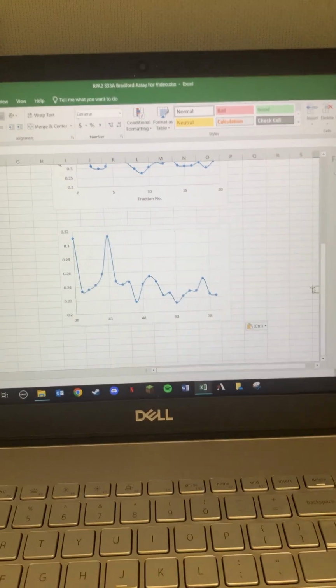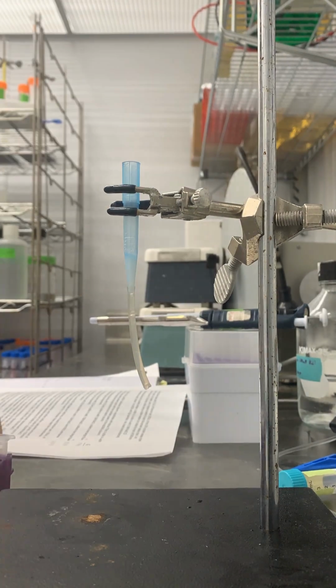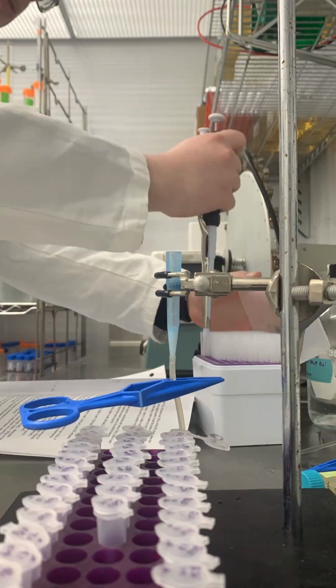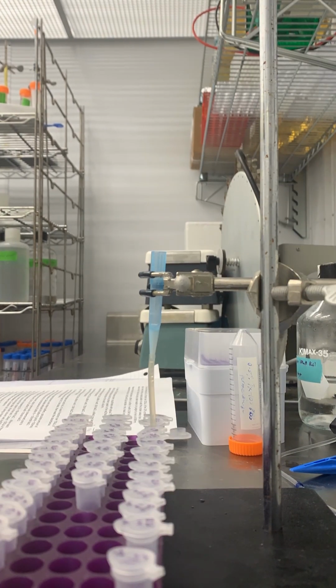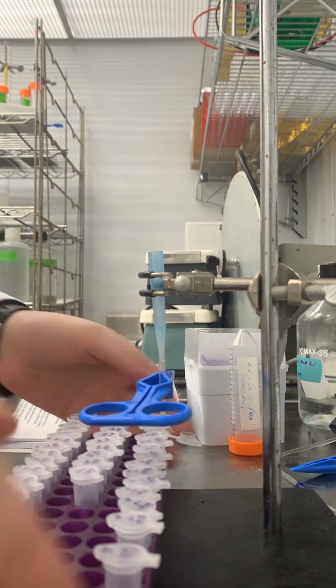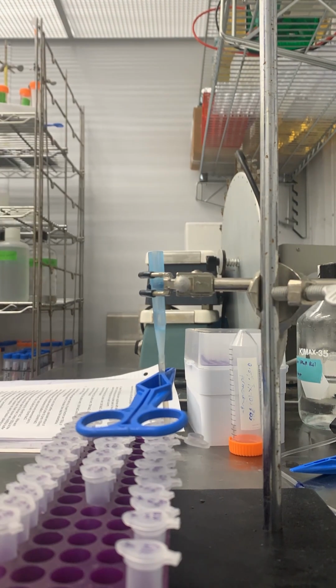The last step involves a Q-Sepharose column that's much smaller than the other two. This column requires many additions of buffers, with slightly increasing salt concentrations to get the protein to flow through. Since this is so small, I can't use the machine and need to manually switch from tube to tube.